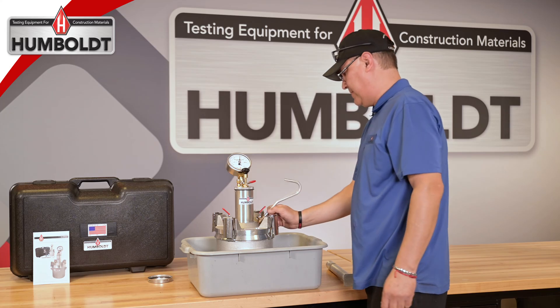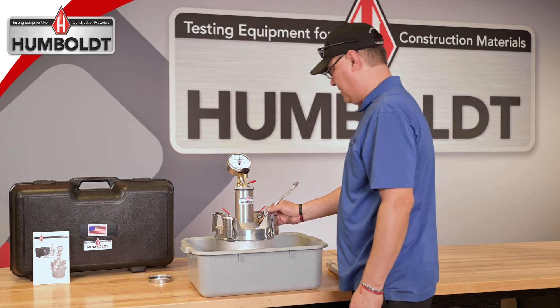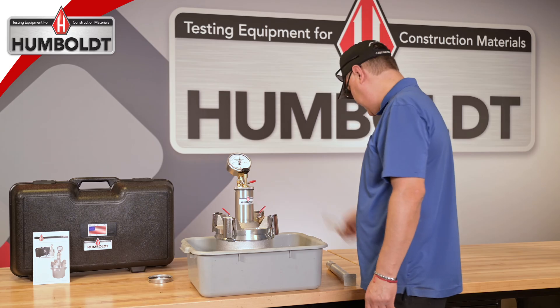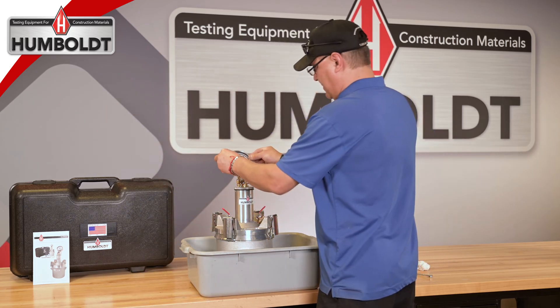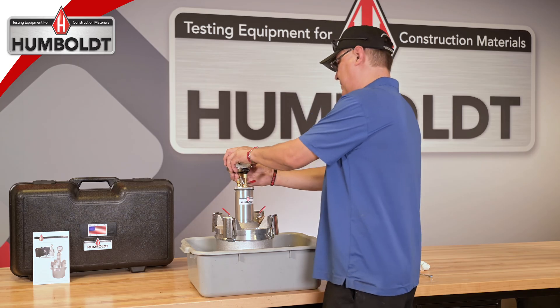Repeat the calibration procedure at least twice to ensure the air meter is reading correctly. Once accomplished and the gauge is reading within plus or minus 0.1 percent of the proper air content reading, your gauge is properly calibrated and ready for use.